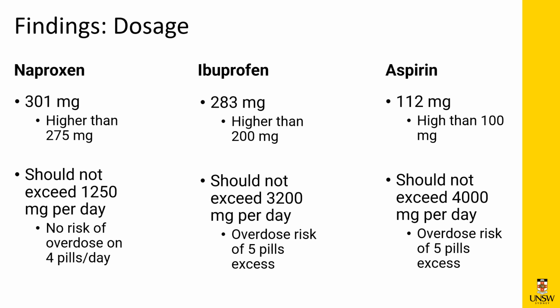For quality assurance, dosages were compared against a calibration curve with a pure analyte to determine only their respective amounts, with a mass-to-charge ratio assigned to their respective peaks. Quality control came from the appropriate use of single-channel pipettes to dilute the exact amount required.